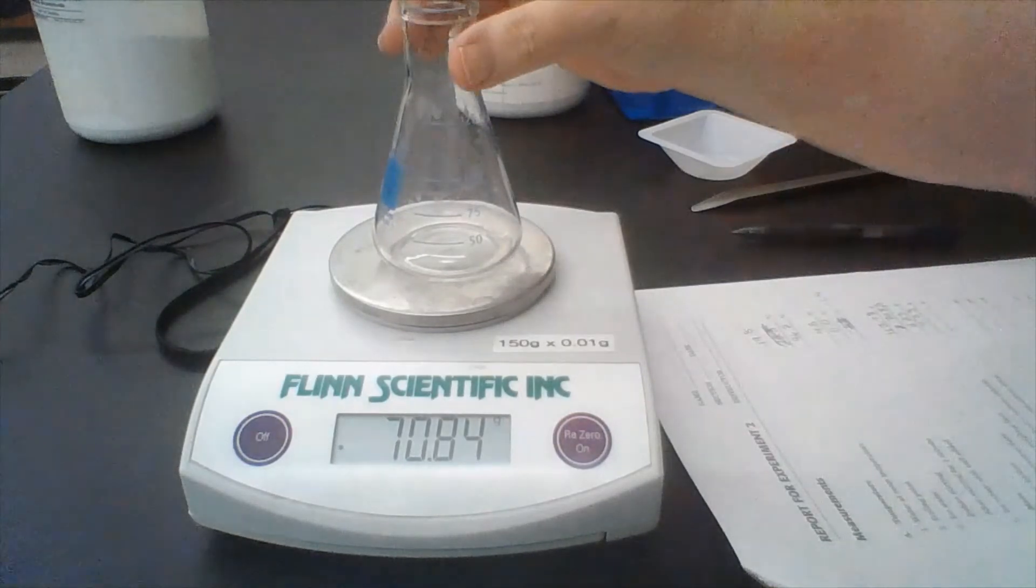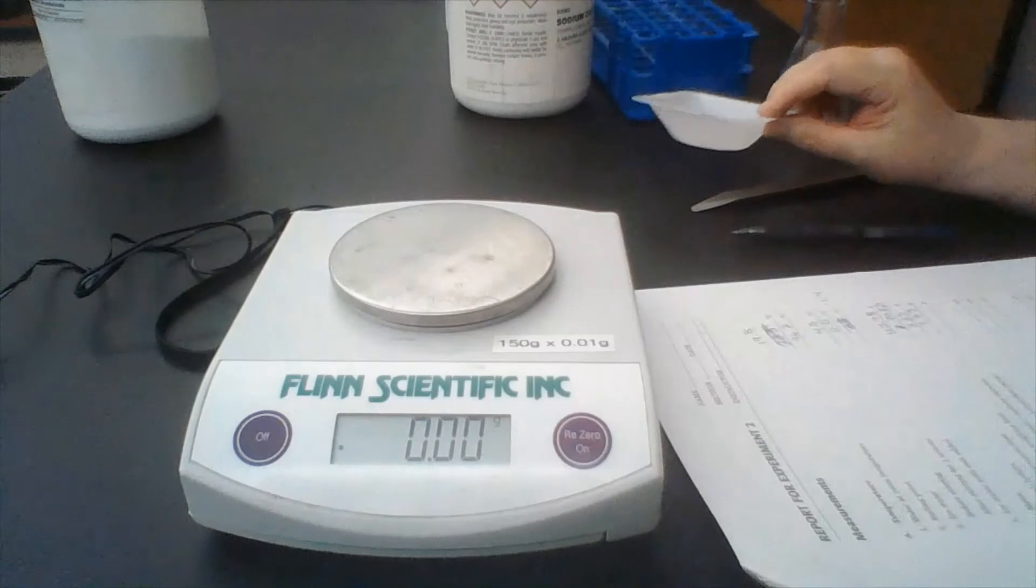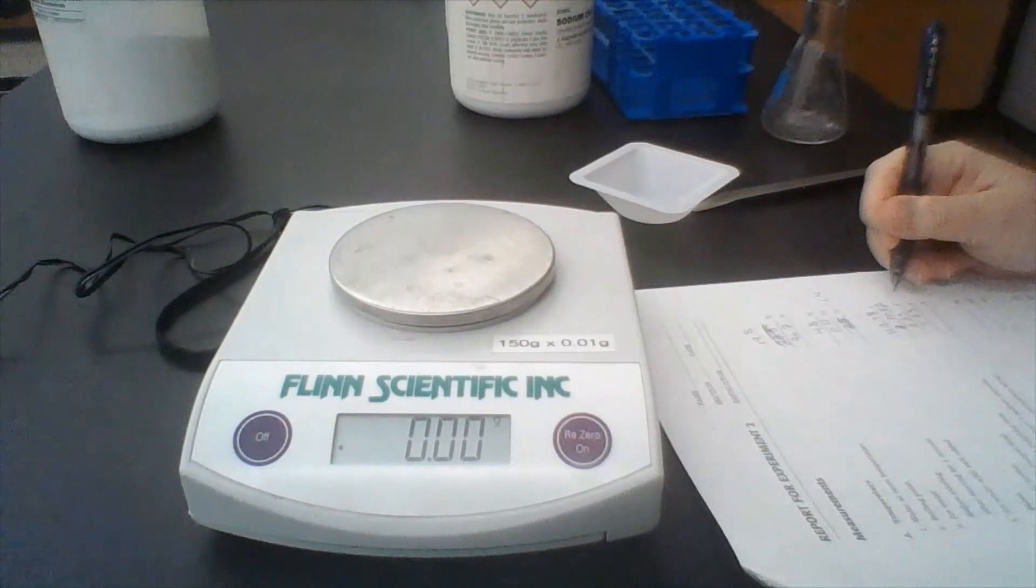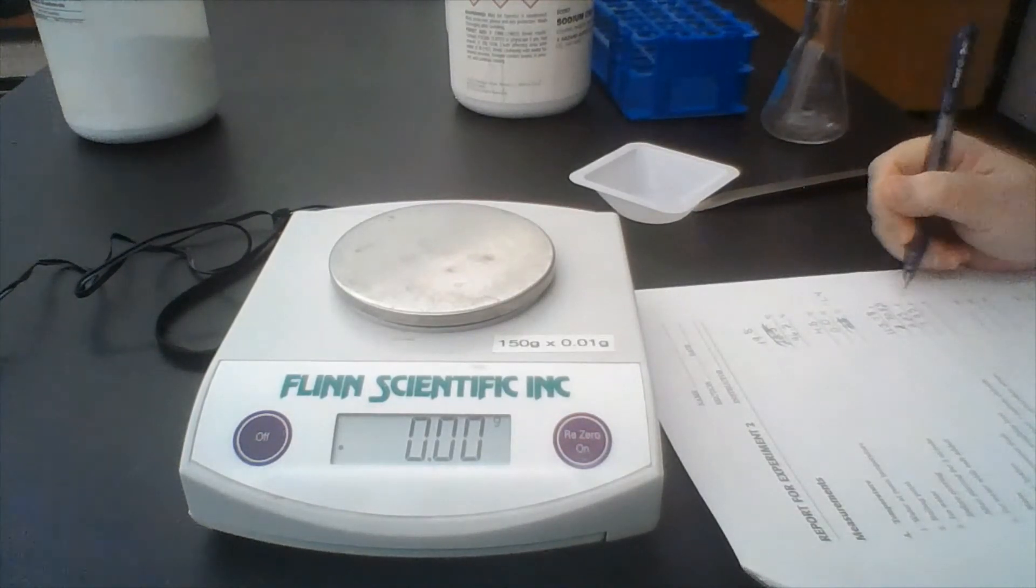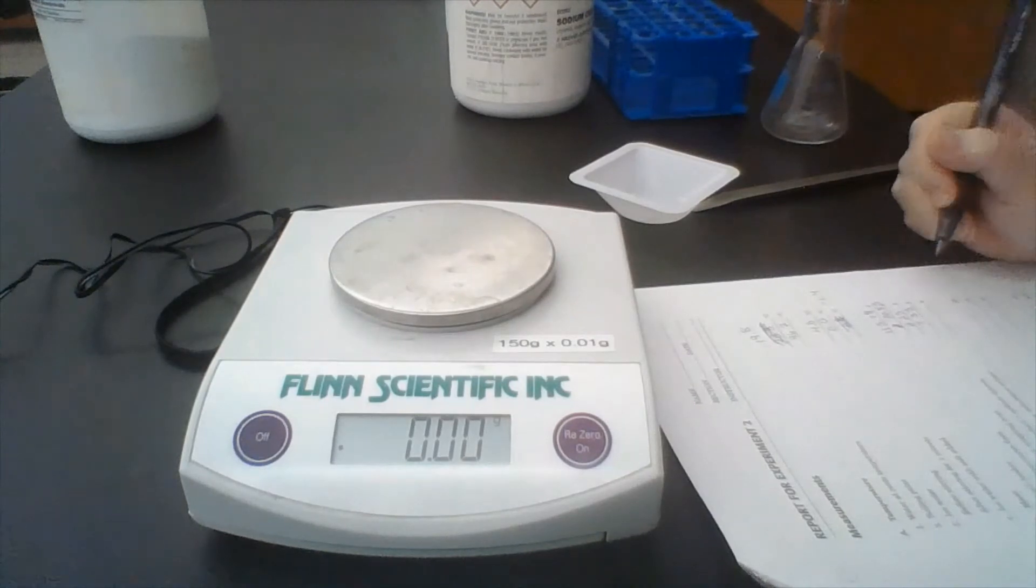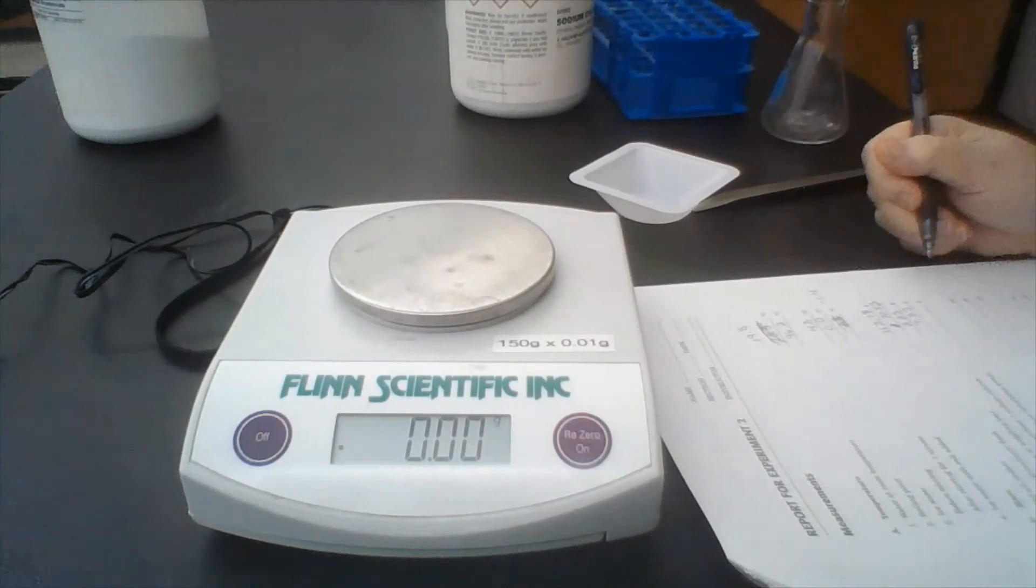Now earlier, we weighed the weigh boat and the weigh boat with salt. The weigh boat was 2.23 grams. That goes under B for mass on number three. And the mass of the weigh boat when I had sodium chloride in it was 7.33 grams. So now you need to calculate the mass of just the sodium chloride, and show me how you calculate that.